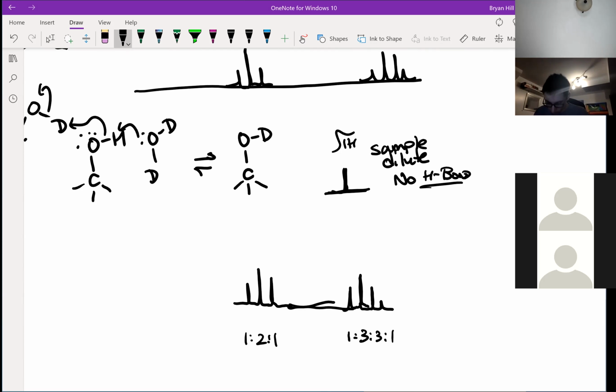Sometimes in spectra, when protons are coupled to one another, they sort of angle in the direction of the proton they're coupling to. This is called multiplet skewing. The outermost lines tend to have unequal heights, and they point in the direction of where the other proton they're coupled to happens to be on the spectrum.